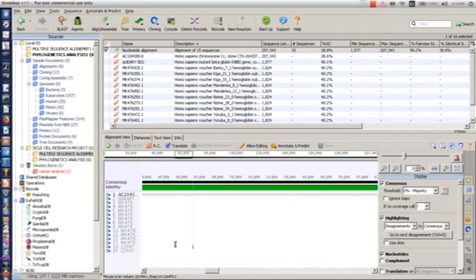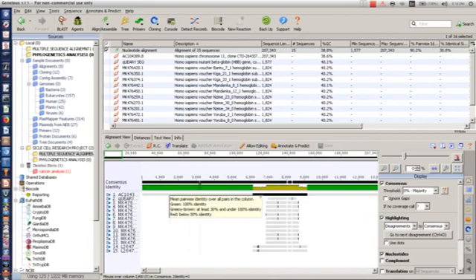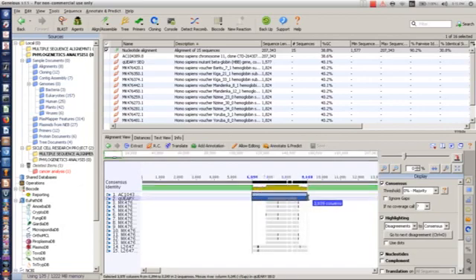But the first alignment, as you can see, is actually not working here. So our query sequence is this red, this black alignment here. And then we have this long one, very long, but our region of interest is just here. It's just here, as you can see.